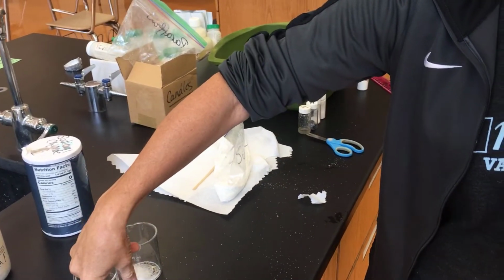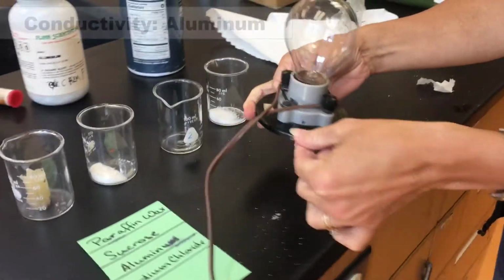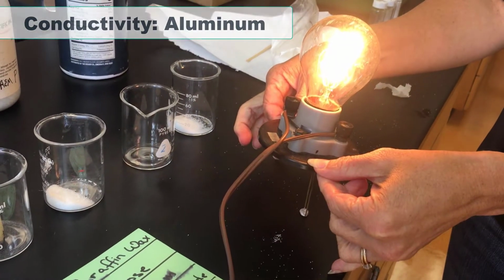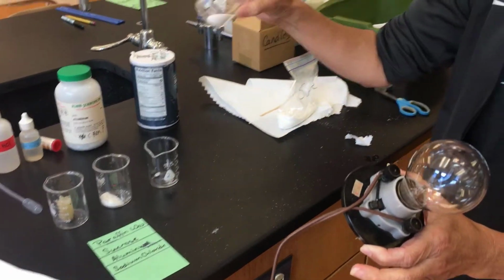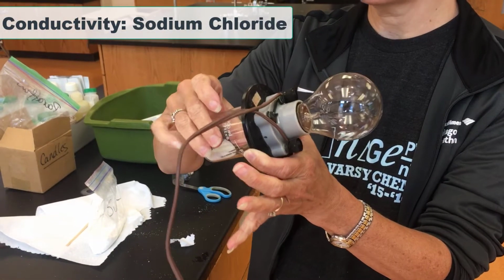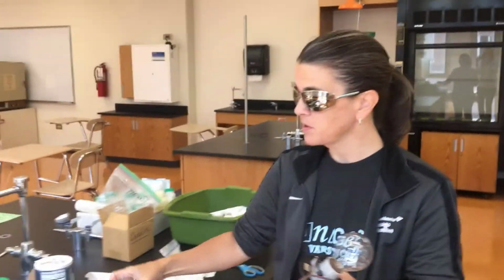My aluminum, I'm going to have to aim carefully on this one. Get my 2 probes to touch it. Ah, we definitely have conductivity on this one. And my sodium chloride, again, just like the sucrose, we'll test it this way. And again, I don't see anything happening. Okay, so those are the tests of the pure solids.